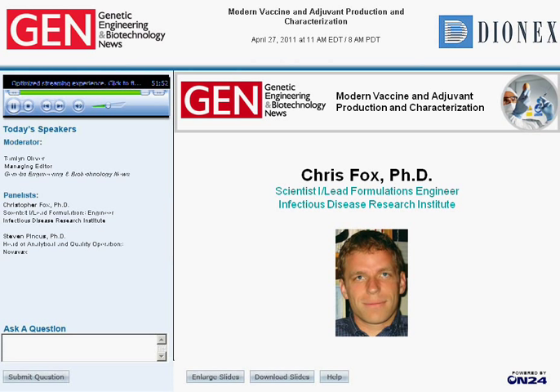So I mentioned in one slide particle size. Steve also mentioned the importance of particle size measurements for VLPs. Particle charge is indicated by zeta potential measurements. These are fundamental measurements that should be done. Also, looking on a deeper level, I think it's very important and exciting to use different spectroscopies such as FTIR, fluorescence, UV-Vis, and calorimetric methods such as DSC and ITC. These are heavily used in drug development, and just now I think they're starting to bleed over into the vaccine field, and they're telling us things that we just didn't understand before and helping us to rationally design better vaccines.